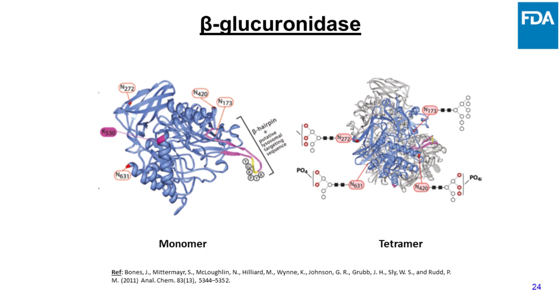Next, we investigated the impact of metal concentration on an enzyme replacement therapy class of molecule, and these are generally used to treat lysosomal storage diseases. Beta-glucuronidase is a good example because it is a lysosomal enzyme protein, and it is a glycosylated protein, as well as it is an approved molecule for treating Sly syndrome or MPS7.